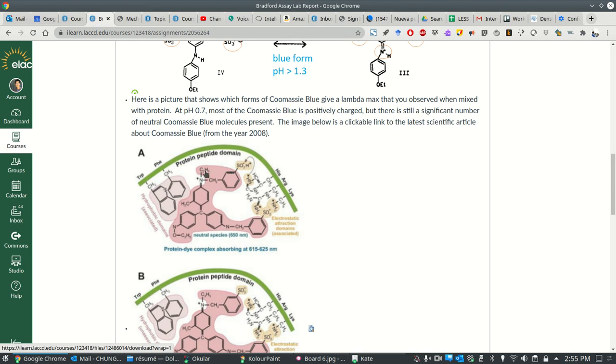I know that there's no chemical bonds, but the binding is still pretty tight because there's this intermolecular force and there's this intermolecular force, and I think, yes, there's this intermolecular force also. This intermolecular force right here, this is actually a charge coupling here. So this is a positive and negative charge attraction here. So this is a full positive negative charge attraction, very similar to a salt bridge, which you will learn about in the lecture. Now, so the binding is tight. It is not the case that this is going to very easily come off.